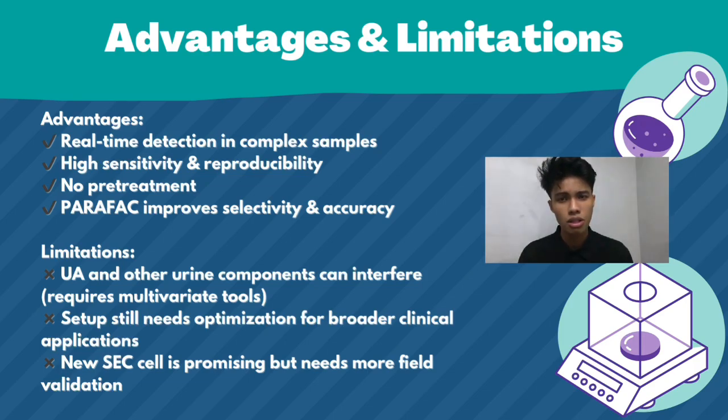However, some limitations still exist. For example, uric acid and other urine components can interfere, so you still need multivariate tools like PARAFAC. The method also needs further validation before clinical use.